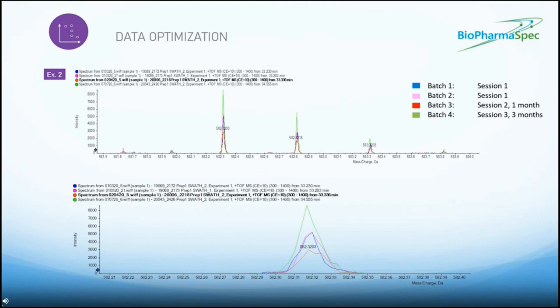So in this next example, we wanted to show the importance of monitoring reproducibility. This is especially pertinent in cases where you might want to perform comparison of batches across months or up to a year, etc. And it's important your experimental setup is practical and consistent. We've demonstrated this here with one of our standards, which is a BSA peptide, and that was done over the course of several projects where we were batch testing the HCP levels. We were looking actually at different sample types.